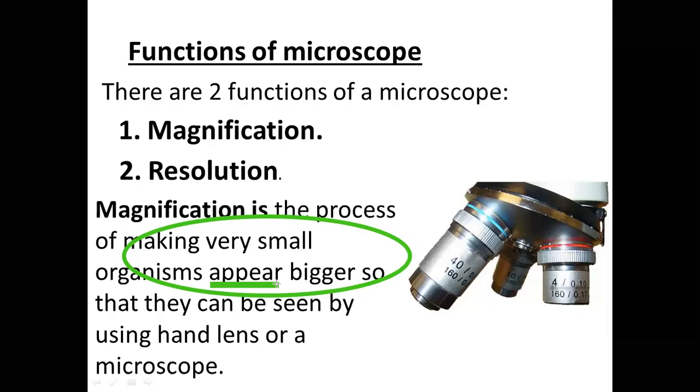An insect cannot be made big by a microscope. What a microscope does is make it appear bigger. Even the word enlarge is wrong, because in real sense it is not enlarging. And I hope that is well taken.